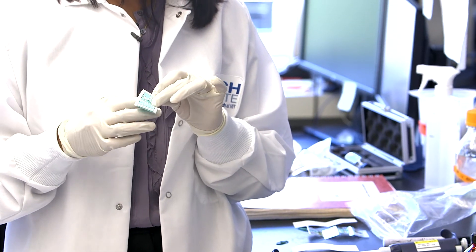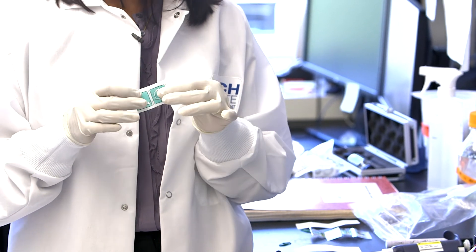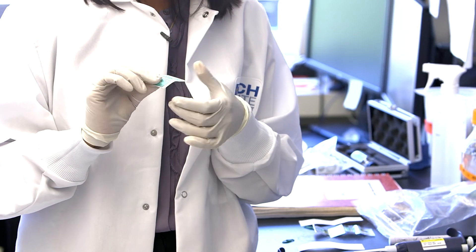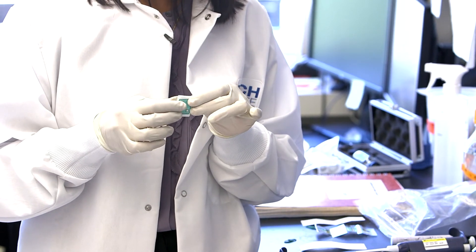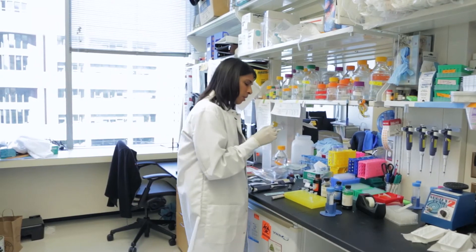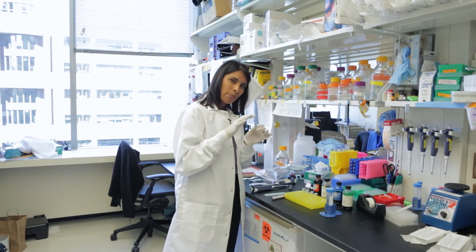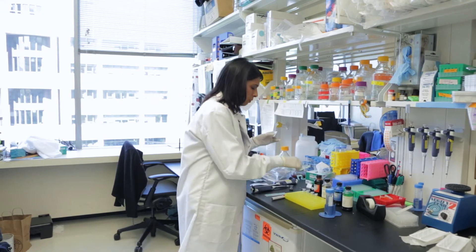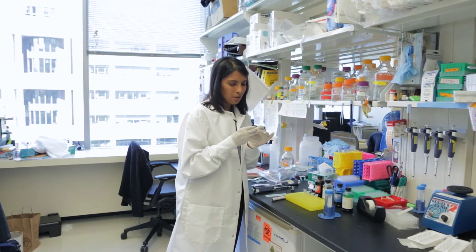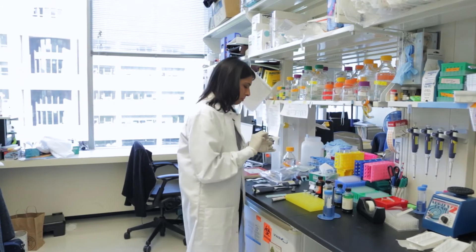I'm going to fold this up now. Folding it in half, and fold it again. The way the channels need to form, we really want all the pieces of paper to be opposed tightly to one another, so we're going to clip them with high-tech binder clips.